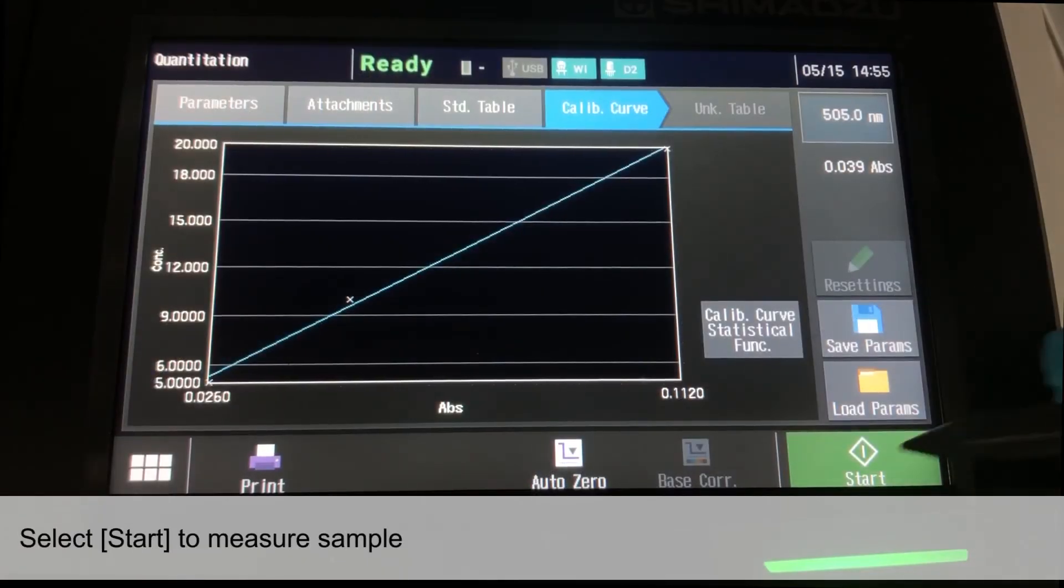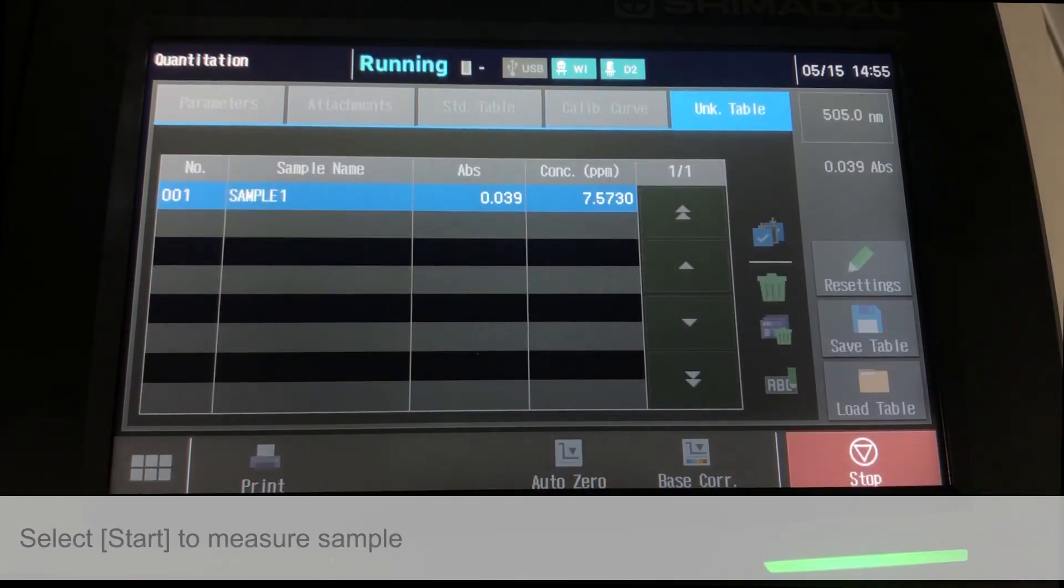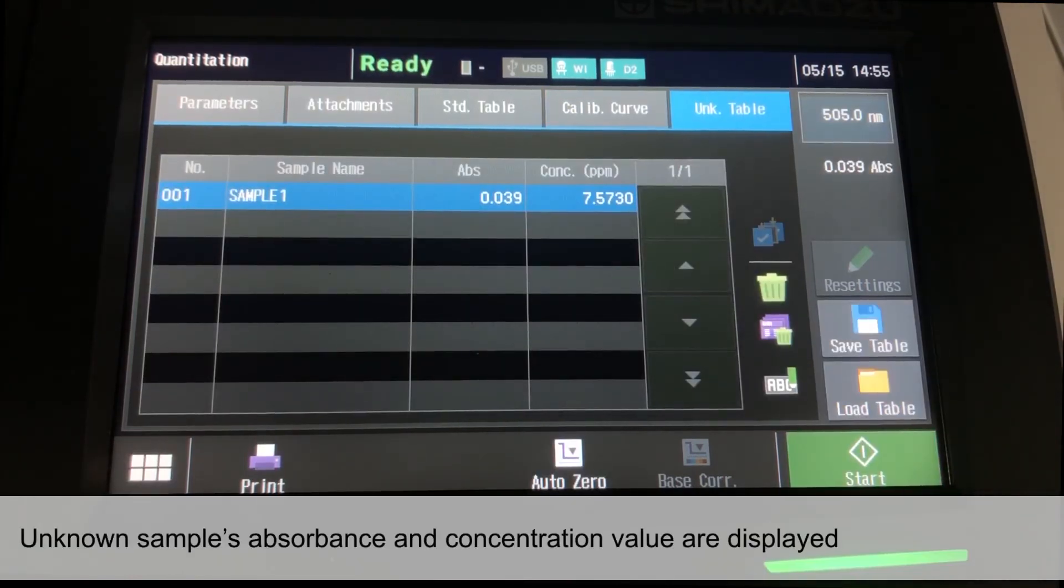Select Start to measure the sample's absorbance. The unknown sample's absorbance and concentration value are displayed in the table.